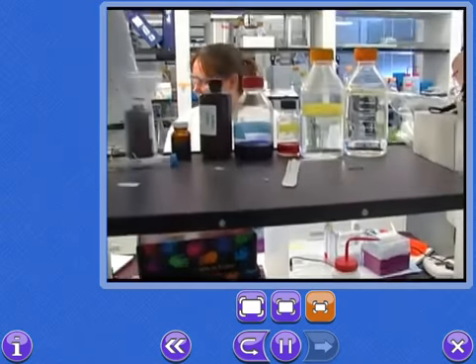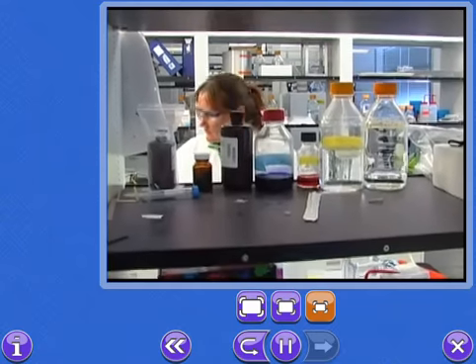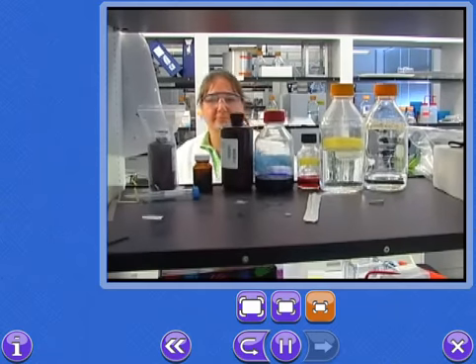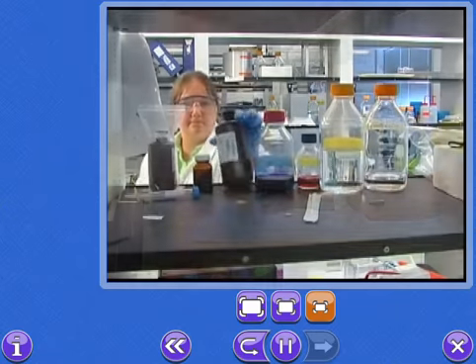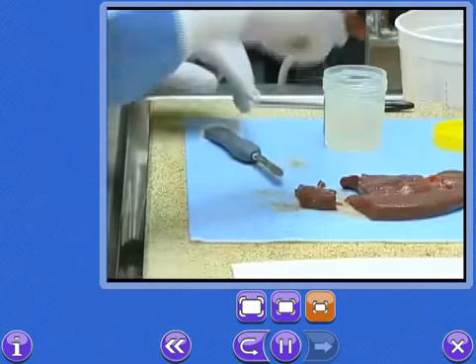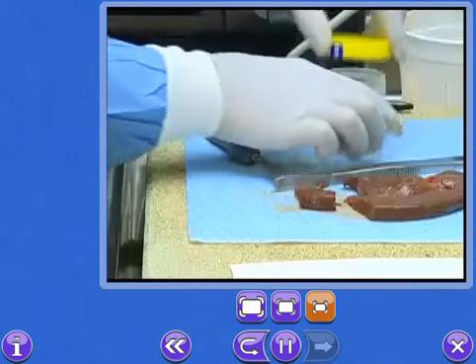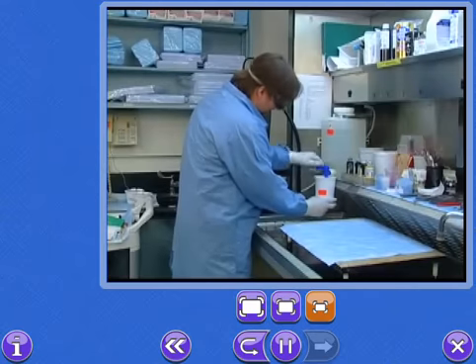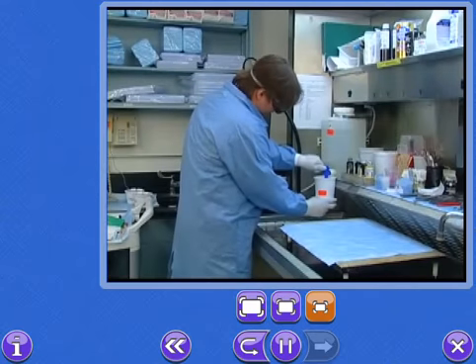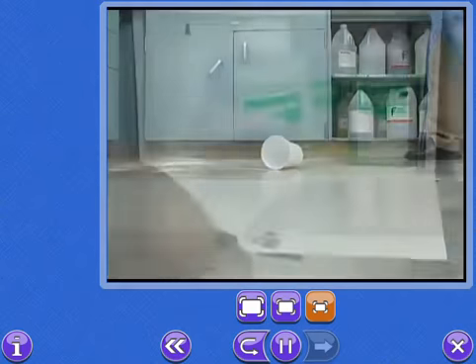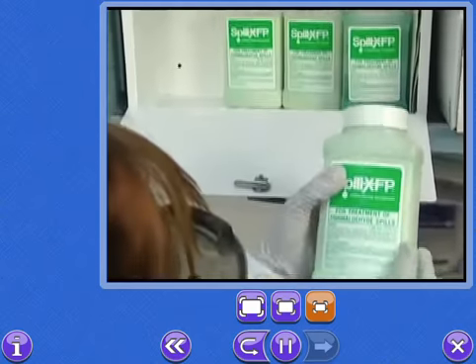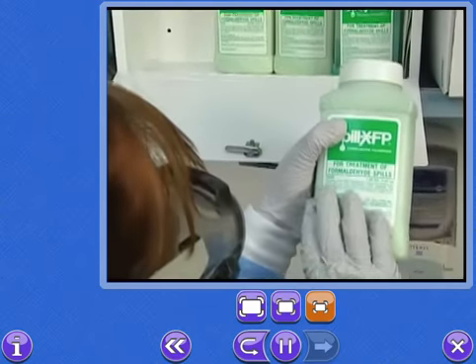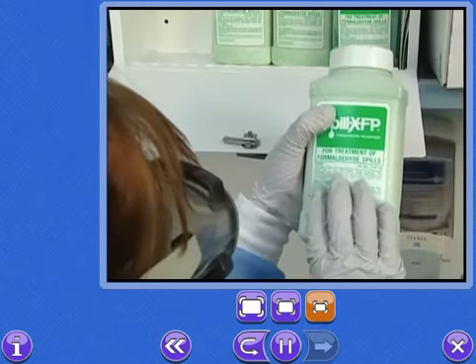Most of us encounter chemicals in one form or another every day. They're used in a wide range of products and laboratory processes and are often essential in our jobs. But if we don't take the proper precautions, many chemicals can be hazardous to our safety and health.